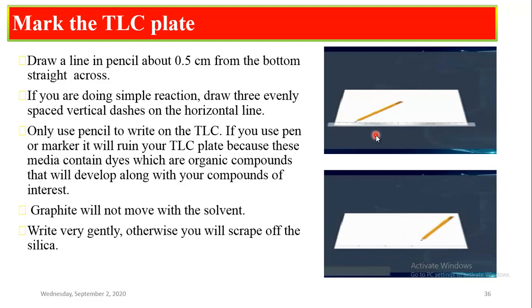If we use any other ink pencil, then it may cause problems because the ink will also separate with the solvent. If we use a lead pencil, it contains graphite which will not move with the solvent. So write very gently, otherwise you will scrape off the adsorbent because the plate is coated with it. So care should be taken.